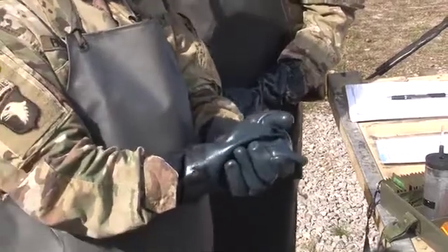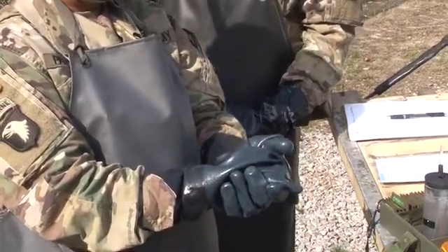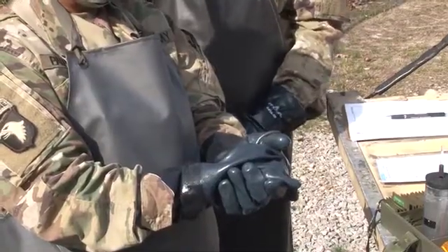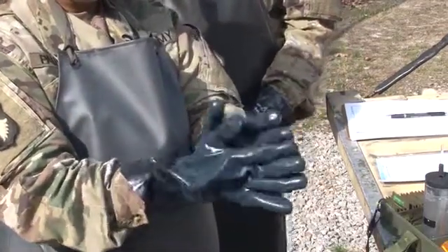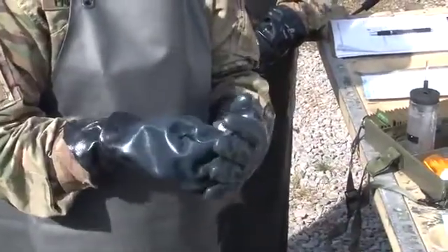If the water is warmer than 50 degrees Fahrenheit or 10 degrees Celsius, then you will continue with normal procedure, which is to hold the clip with the ticket in your closed fist for 3 minutes. After 3 minutes, remove the ticket from the clip and pull the silver cover completely off, exposing the second patch.